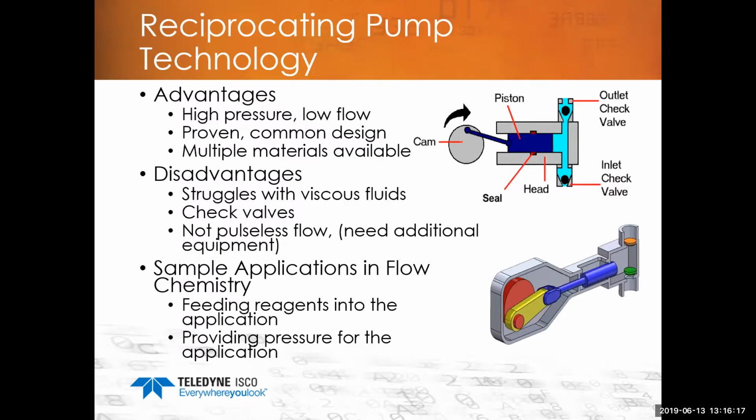I will tell you though, and this is something to consider when you're looking at your application, if you have viscous fluids that you're going to need to pump, and you don't want to spend the money for the syringe pump, this is not a technology you'd want to look at. For the most part, these pumps have check valves in them, and they will get gummed up with viscous fluids. That's just the way check valves are designed. And it's not a pulseless flow. You can add a pulse dampener to the device, whether inline or on board, and it will reduce some of the pulsation to a point. But for the most part, you're not going to get the pulseless flow that you would in a syringe pump.